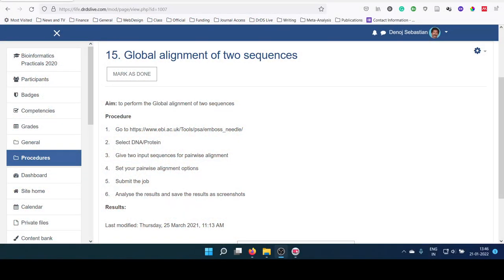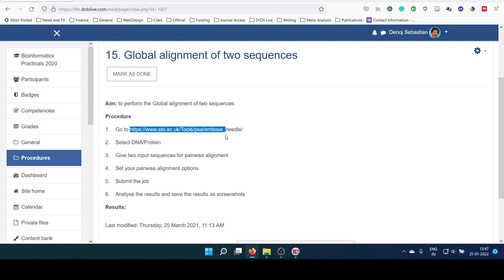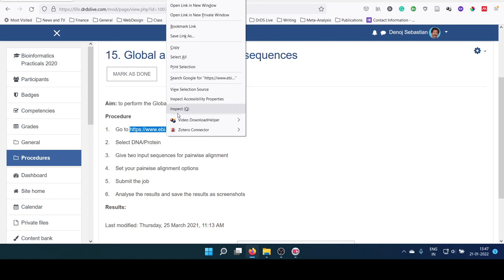In the practical procedure, given as the 15th item in the platform, you can see there is a link that is given for Needle program from EBI. You can open that link.